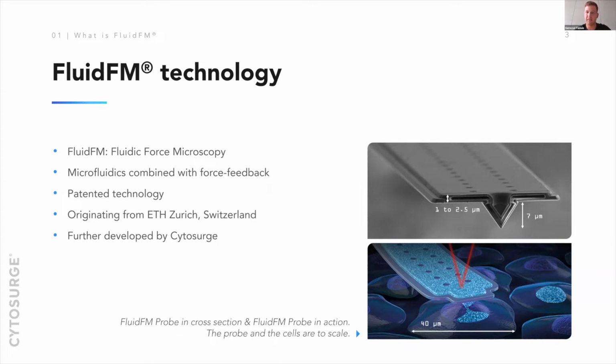these tiny cantilevers that you can also see on the picture. These cantilevers are roughly 200 micrometer long, and they contain a microfluidic channel. Now, these cantilevers can interact with cells, and this interaction is something that is constantly measured through the force control feedback loop. And at the same time, in the microfluidic channel, we have a liquid that is dependent on the experiment itself. And this liquid can either come out of the cantilever by the application of positive pressure, or it can go into the cantilever by the application of a negative pressure.